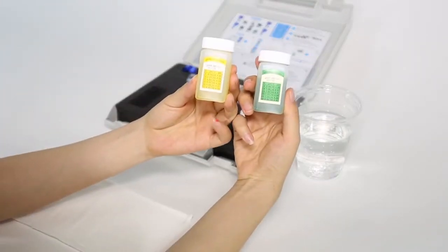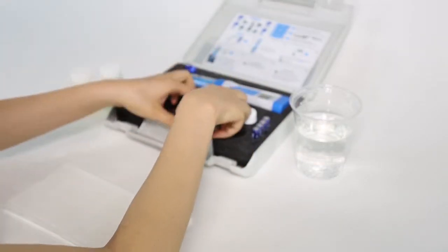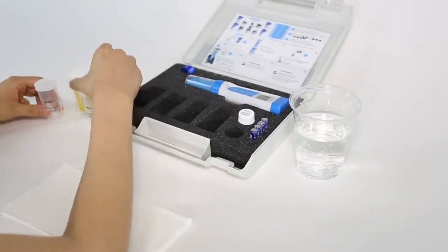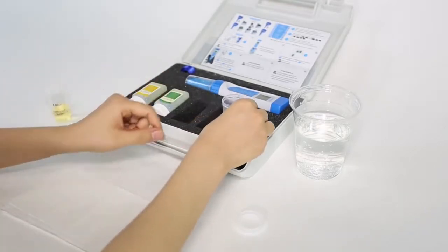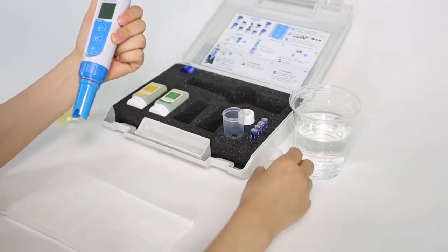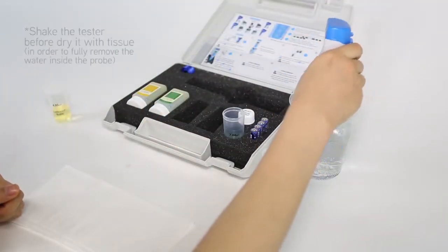Pour some pH 7.00 and 4.00 calibration solutions to about half of the accordant calibration bottles. Replace the calibration solutions once they become contaminated. Clean the probe in distilled water and dry it.